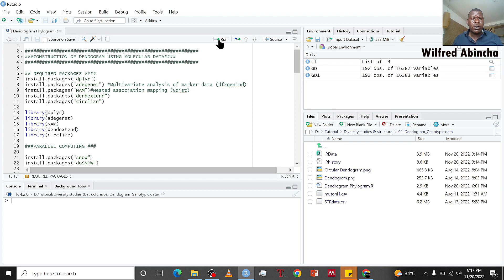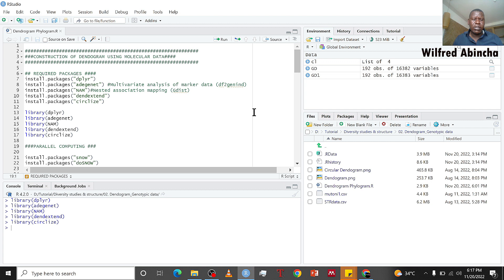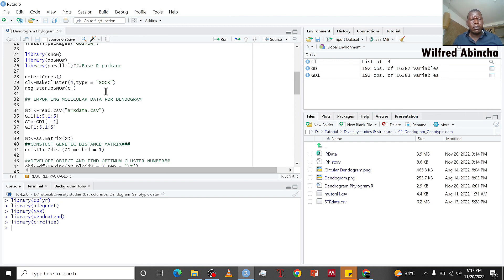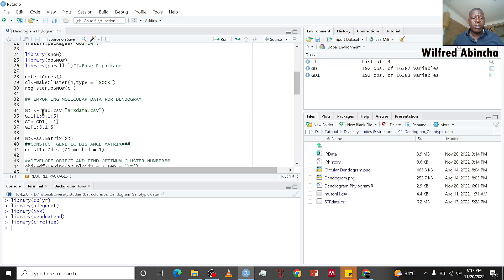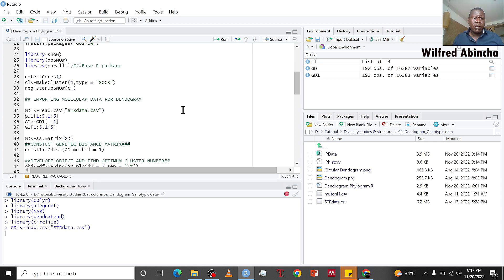After this, the most important stage is to import the data we want to use. I'm going to import my molecular data. This is data which has SNP markers of around 200 individuals and I've saved it in CSV format, so I'm using read.csv function and calling it gd1.